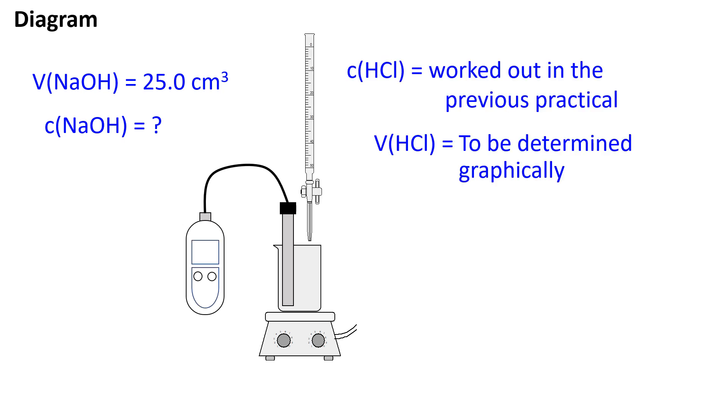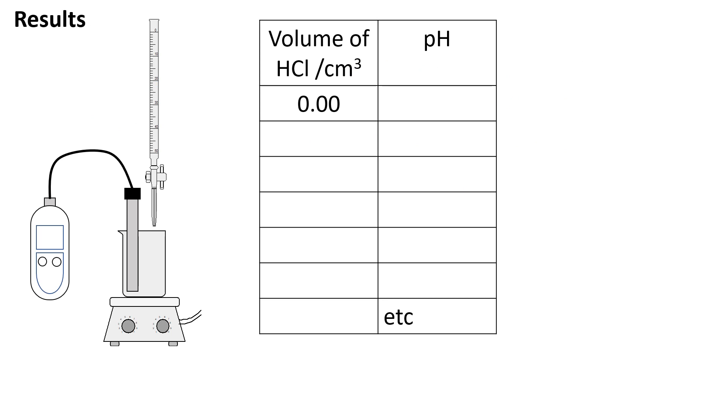A burette is rinsed and filled with the hydrochloric acid solution. The concentration of this solution was determined in the previous practical. The initial pH is read and recorded to two decimal places. There is only sodium hydroxide in the beaker at the start of the reaction, so the pH will be greater than 12.